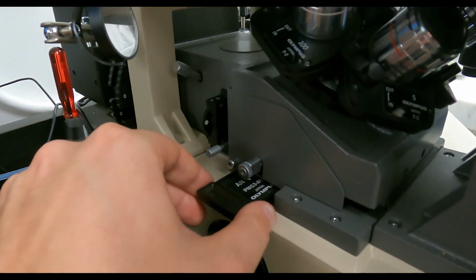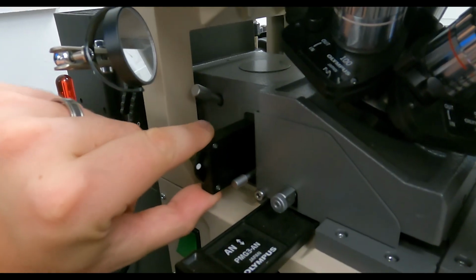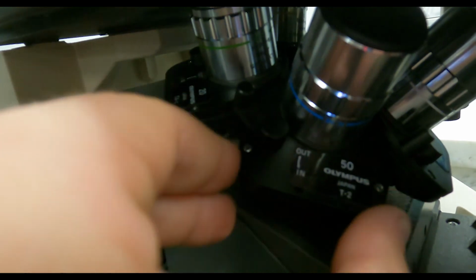Remember that if you are using the polarizer at the end, take the polarizer, analyzer, and prism out, so that when people go to take their normal bright field images, which most people use, they're not confused as to why their images look weird, which would be because you left the polarizer in.